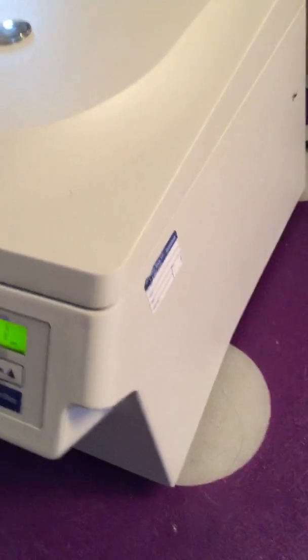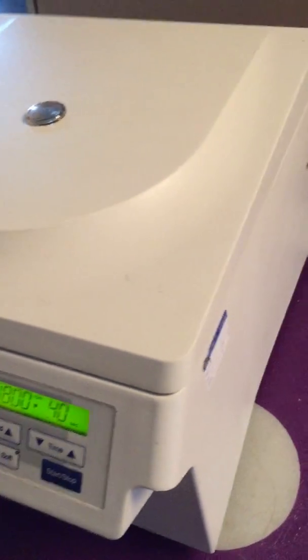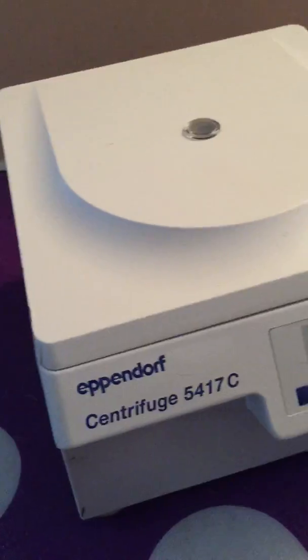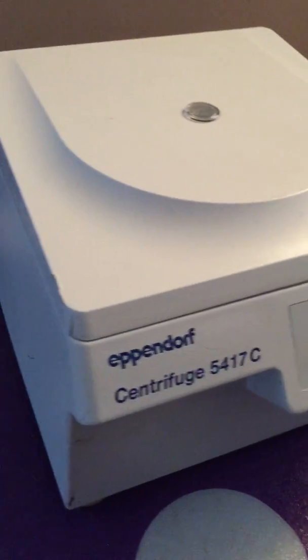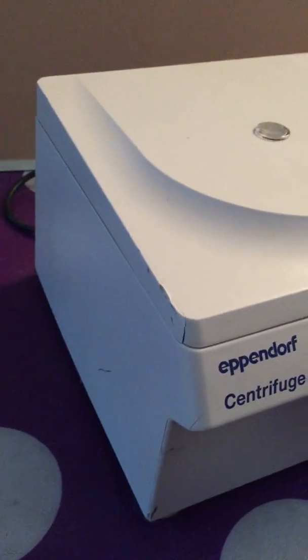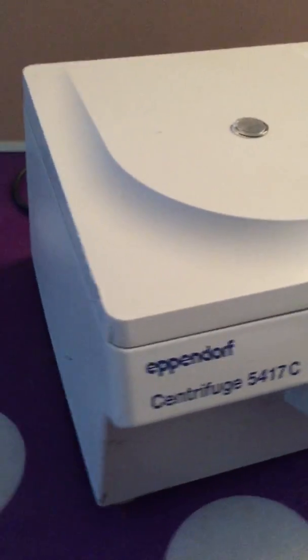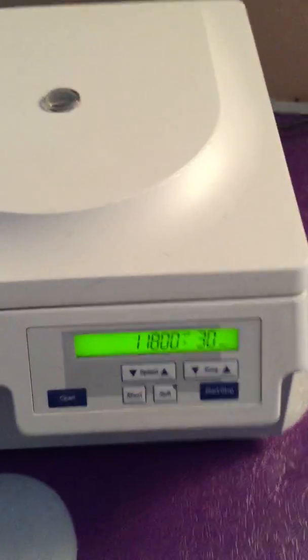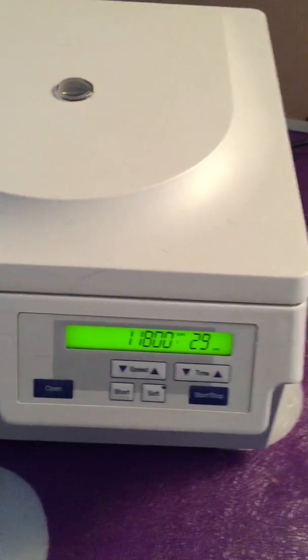It's a beauty, so whoever buys it will be doing a great deal. I highly recommend this centrifuge at this price in this excellent operational condition.